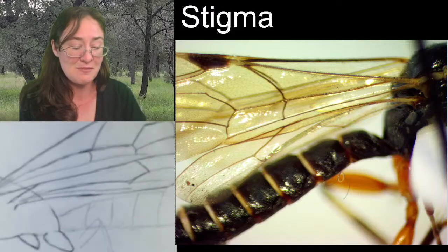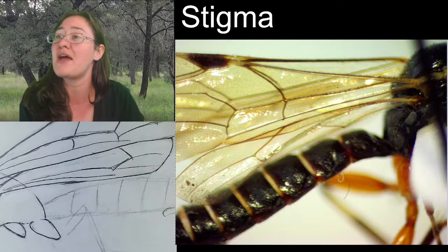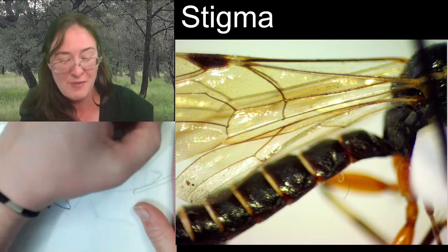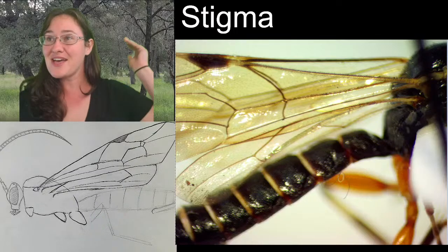So that's going to be how I sketch my hind wing venation. That's what I can come up with. It might not be exactly that, because you can see our hind wings are a little bit folded. But that is, to the best of my knowledge, what I can see. And that's all that you can ask for.